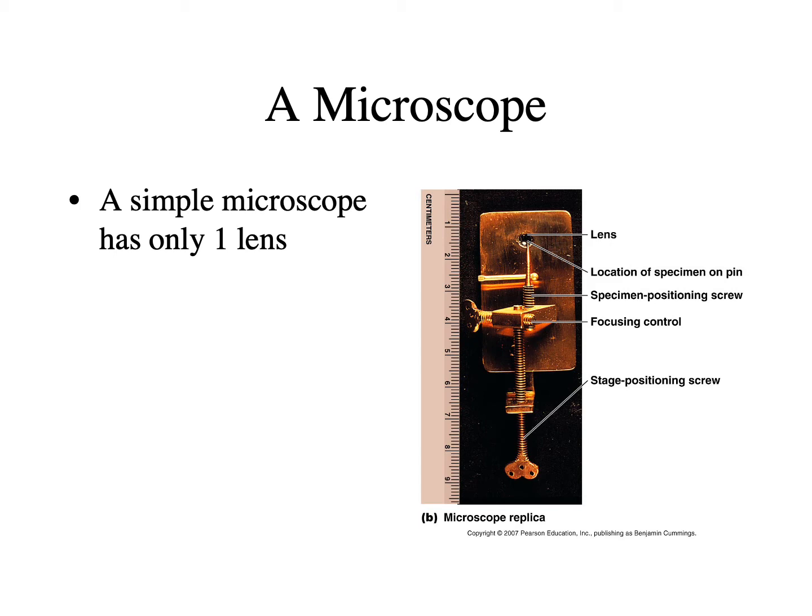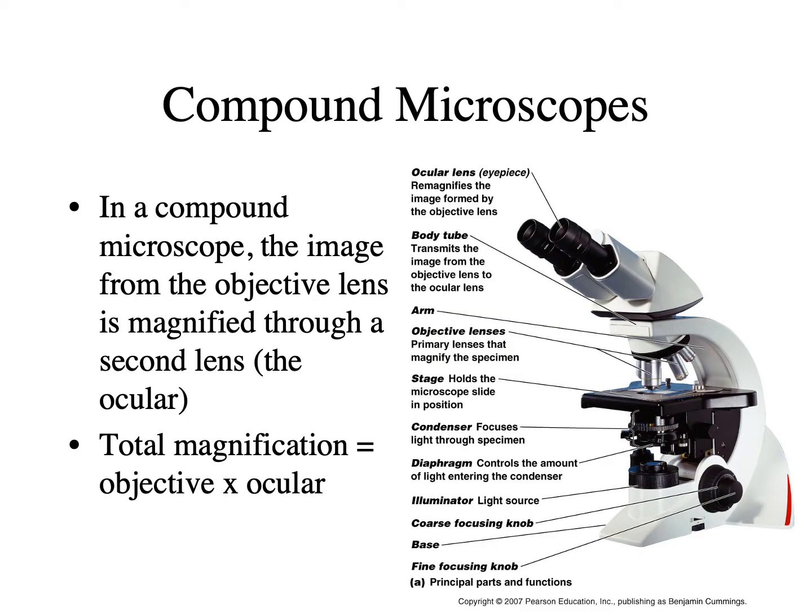So back to the basic idea of a microscope. It's a lens that's curved glass that allows you to see something bigger, and the ability to focus. Leeuwenhoek's microscope is basically in our compound microscopes. It's just we're fancier today. We have one magnifying lens in the eyepiece, the ocular, and we have a set of objective lenses that we can change the magnification of.